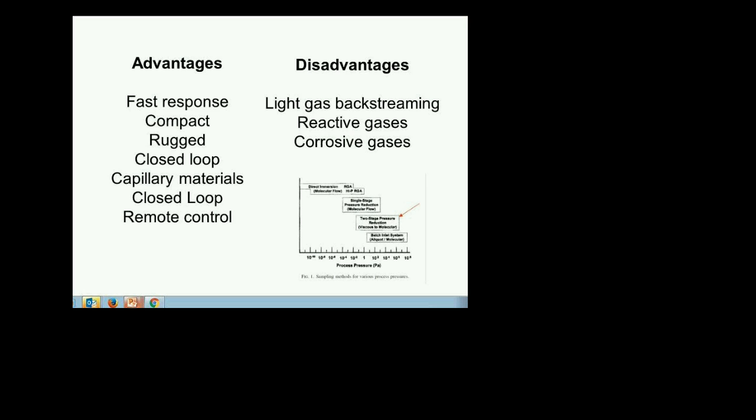Yes, that's very common. That's high energy physics labs. If you look at their specs, they do this all the time. So it will work. And if you baseline, you get your background every time on the chamber by itself. It's like I said before, you almost want to have a poster on the wall to show you where you're starting.